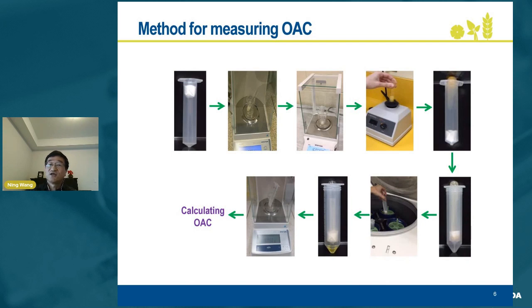So you add oil into the test tube. And then you vortex it, and then you leave it for a certain time, and then you place the test tube inverted into the syringe barrel with the filter paper at the bottom of it, which you then place into the 50 ml conical centrifuge tube. So you centrifuge the sample for a certain time at a certain G force, and then you can see the oil pass through the filter paper. So then you weigh the syringe assembly.